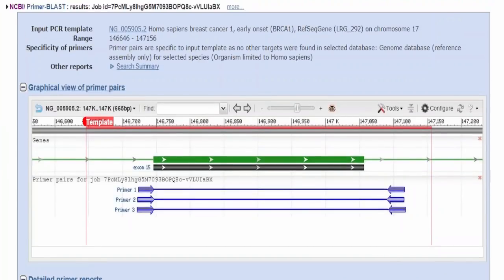Okay, we have time, I think, to do really only one more example. There are 2 that are sort of possibilities that you can look at. I want to make sure that we get to see MoleBlast. I think the first one I want to do is to go ahead and search another Genomic Blast page just so you can see what a WGS hit looks like.